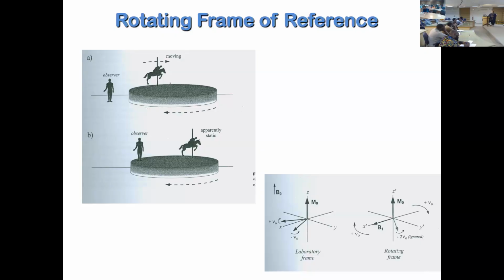And when they are moving very fast, you see the spectra, and you see their velocity in hertz, right? If you convert ppm and multiply with the frequency of your spectrometer, you get the hertz. So there are only a few hertz that you actually observe. Why a few hertz?